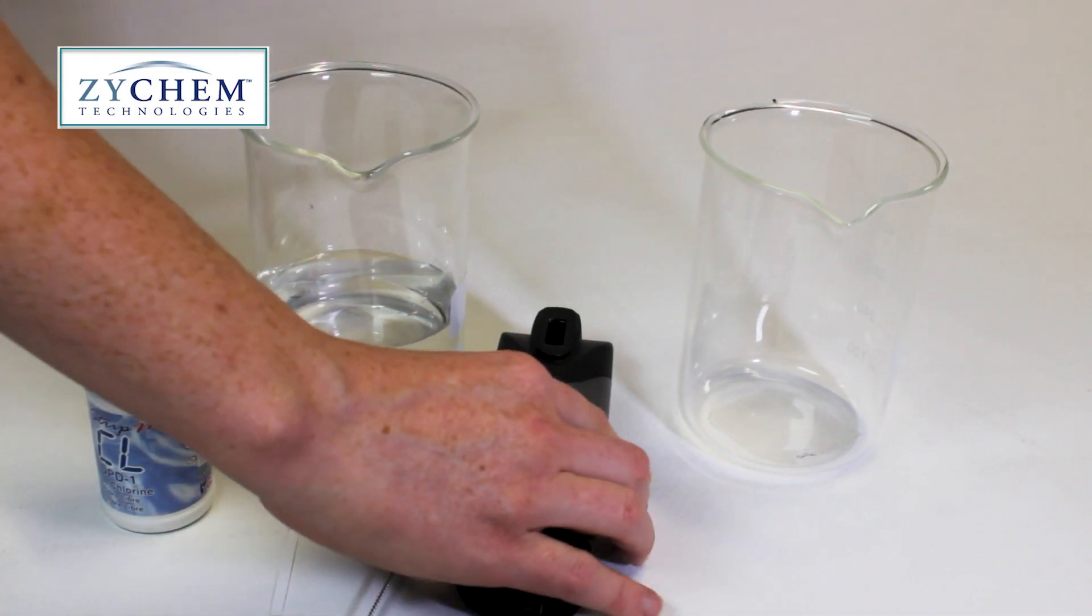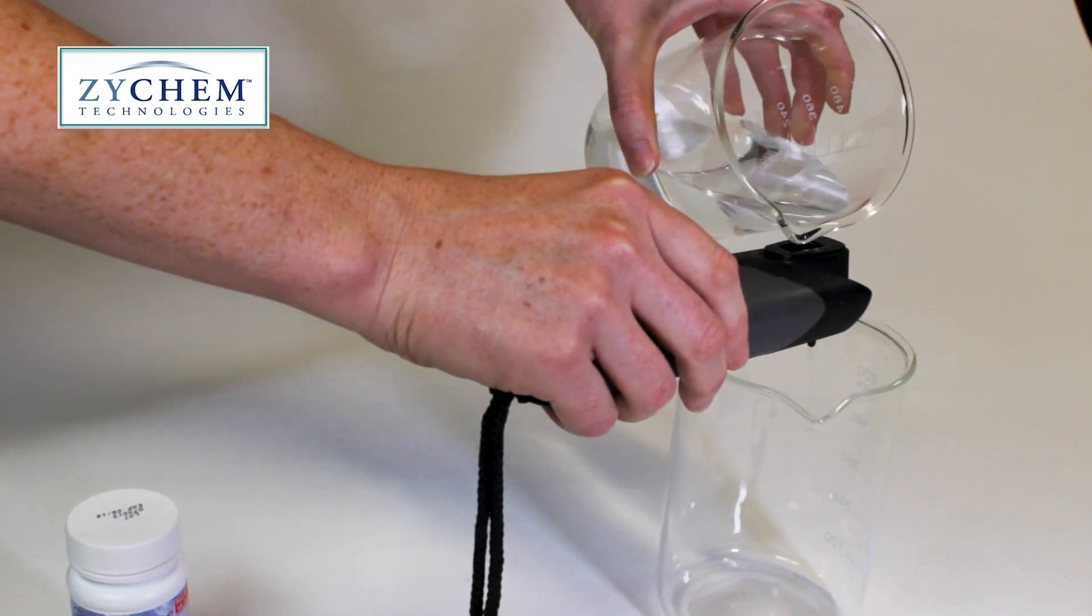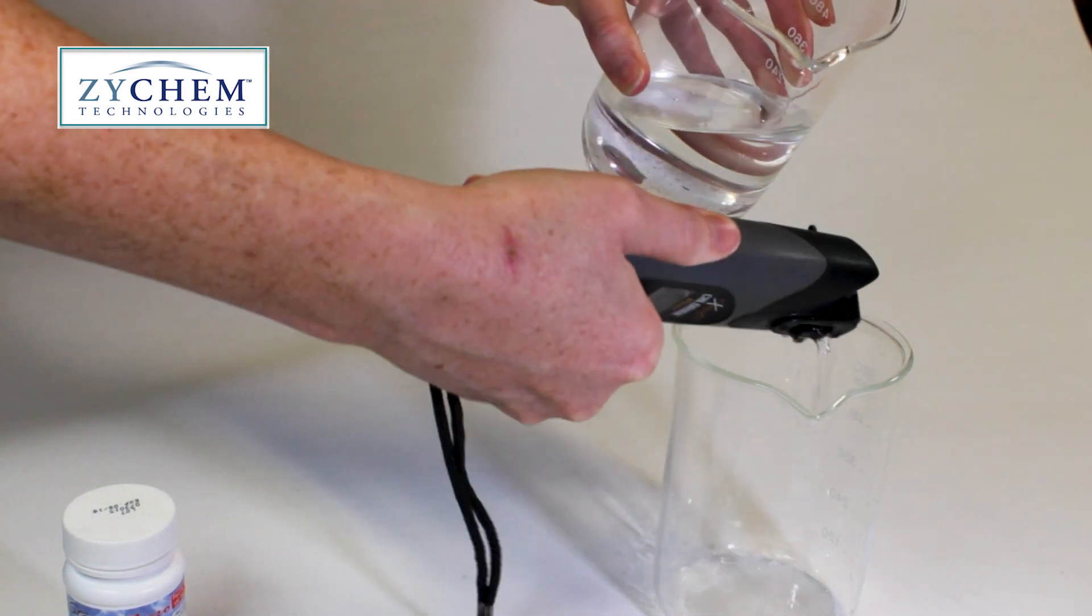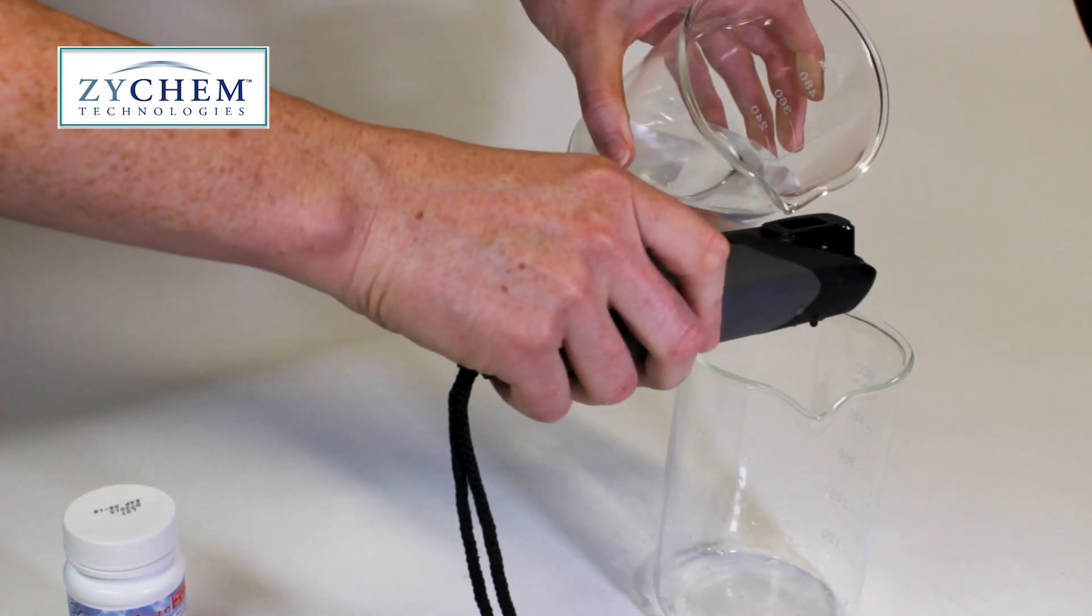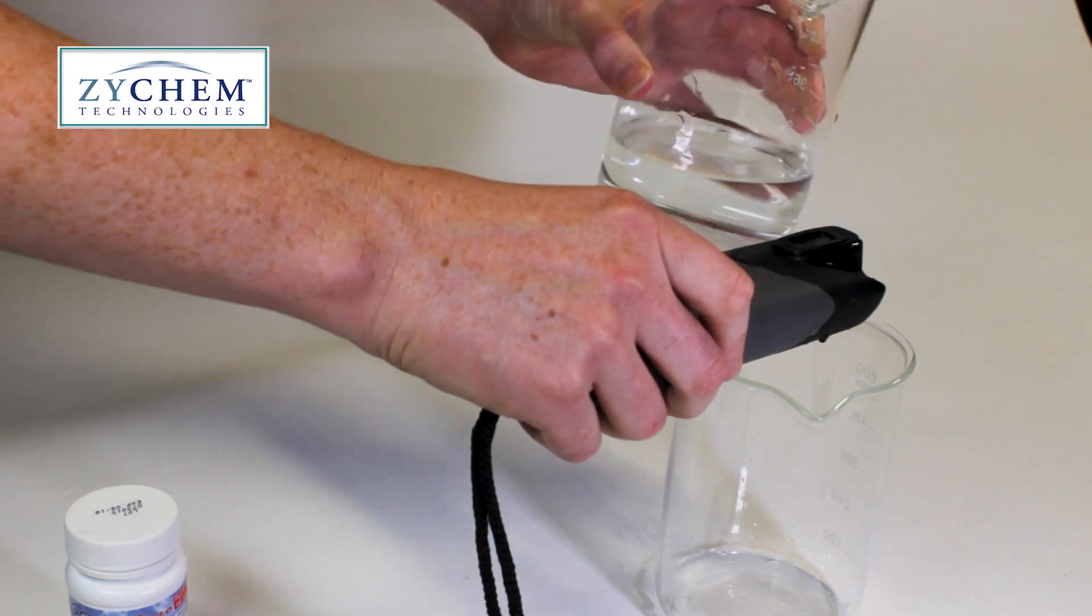Then we're going to fill the sample cell in the unit three times with clean water, discarding between each fill. Rinsing the cell like this before we run our test will ensure the sample cell is free from cross-contamination or impurities, and that the results we get are accurate for the water sample we're actually testing.